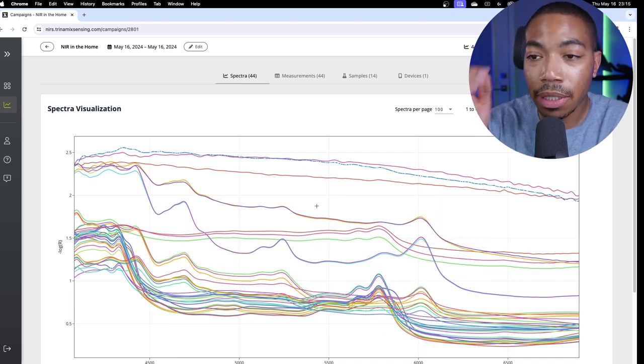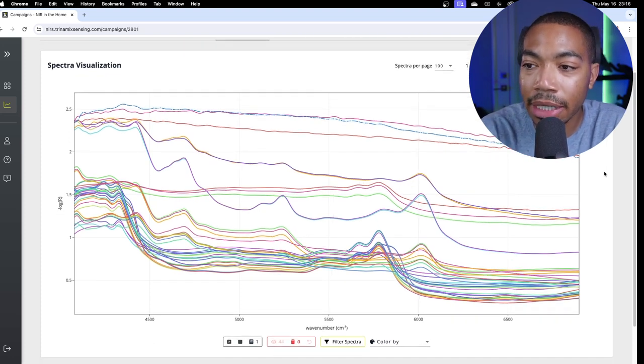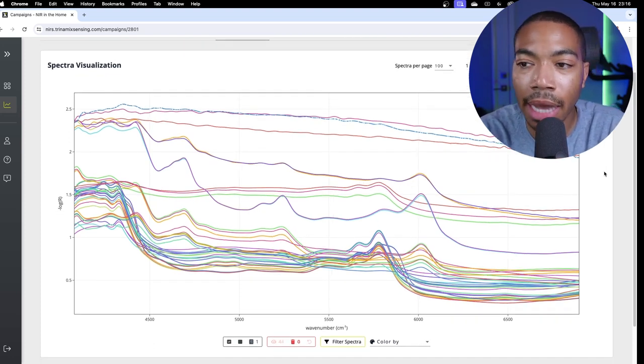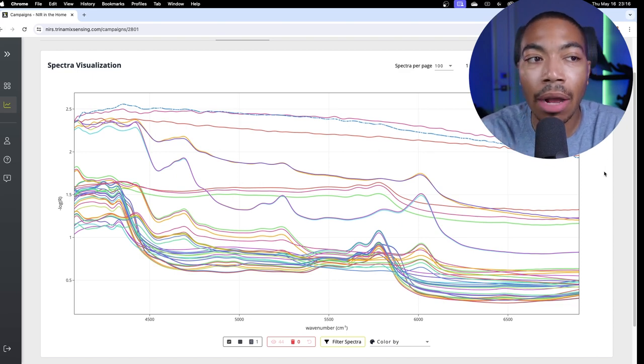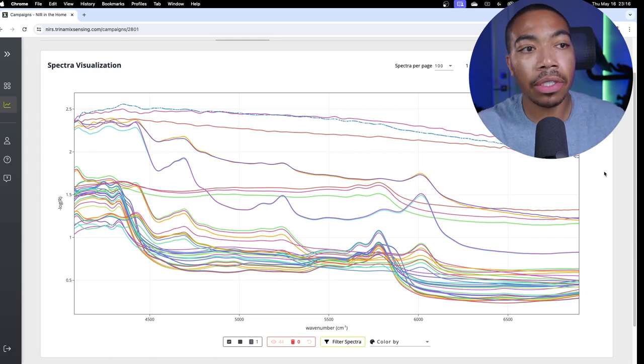And so it'd be really cool to see what signal processing and the additional metadata context can tell us about the types of plastic, maybe the color, and how that might contribute to the patterns that we see here. But also, as we start adding some different material classes altogether, how those separate in the multidimensional domain, like pharmaceutical compounds, lotions, oils, conditioners, shampoos, which we'll be doing in future videos.